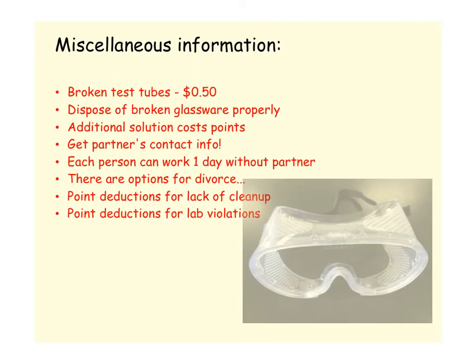Some other miscellaneous information before I get into the actual general techniques for this lab is if you break a test tube, it's going to cost you and your partner 50 cents. So be gentle with our test tubes. They cost us money to replace, so you are going to pay for them. If you do break something, make sure you're putting it in the appropriate broken glassware container. Like I said earlier, if you need more solution, like you've done 3 trials and you still can't find lead, you're going to cost some points.